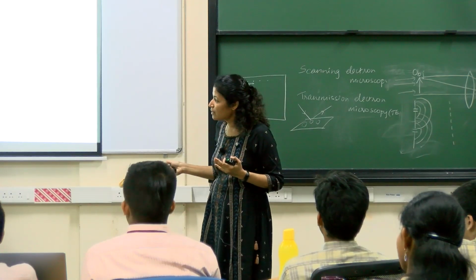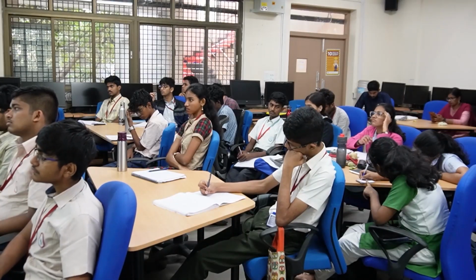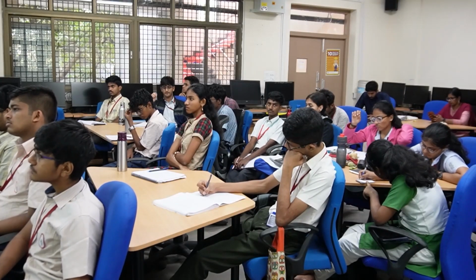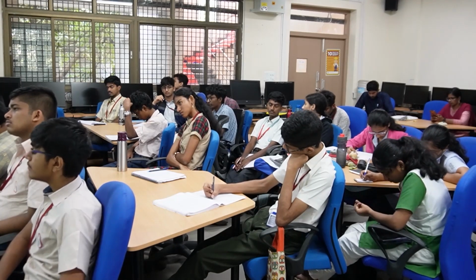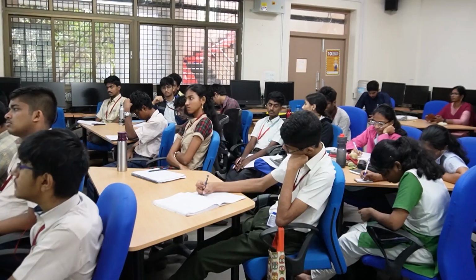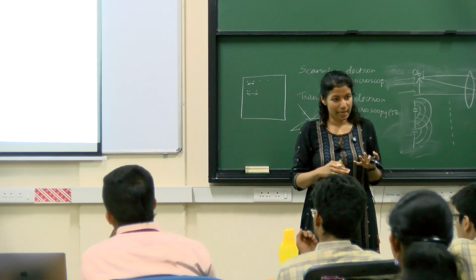This is the kind of image that you will see, and it has all kinds of views of your protein of interest. Whatever your complex is, you will have different views because it's all suspended. You will see all different orientations of your molecule of interest when you pass an electron beam.